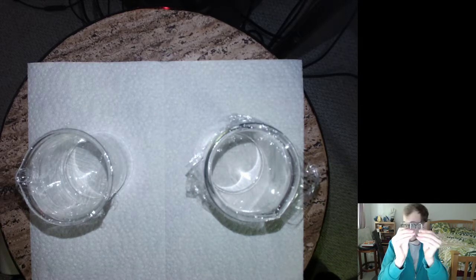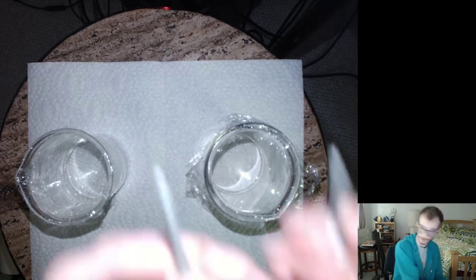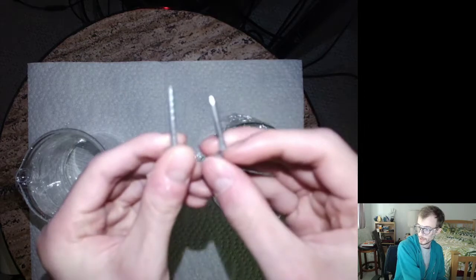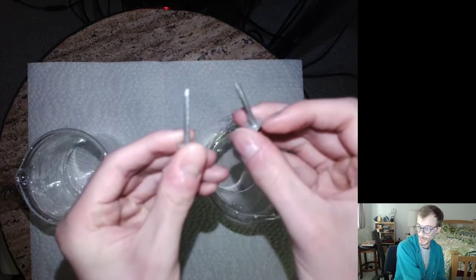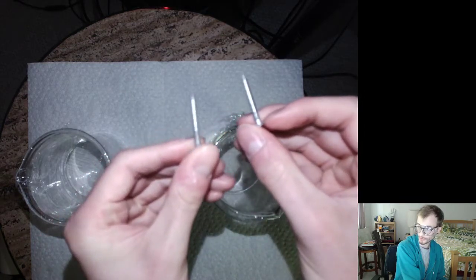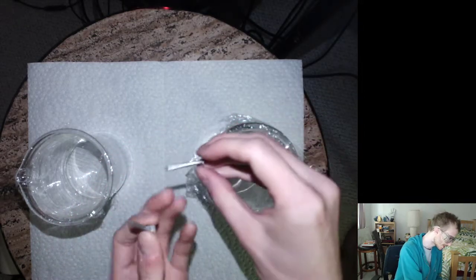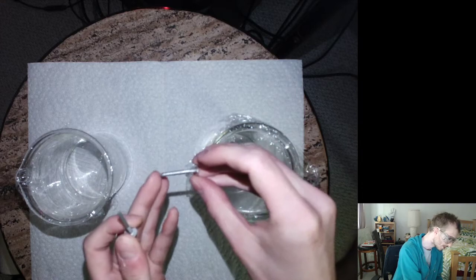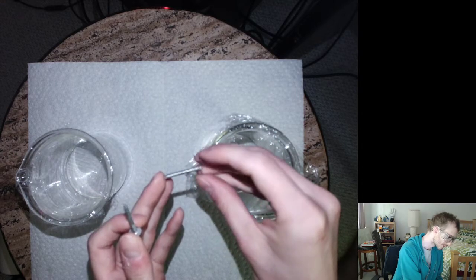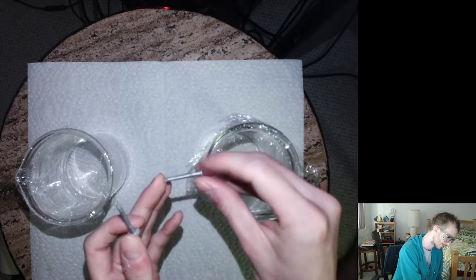I have here two nails so you can see them. These are housing roofing nails, so they're stainless steel, but they've also been coated with a layer of zinc.